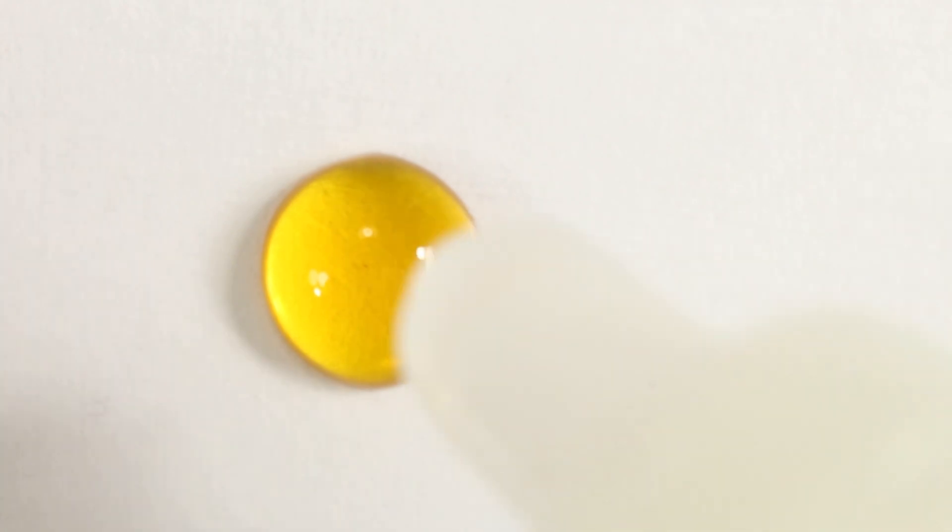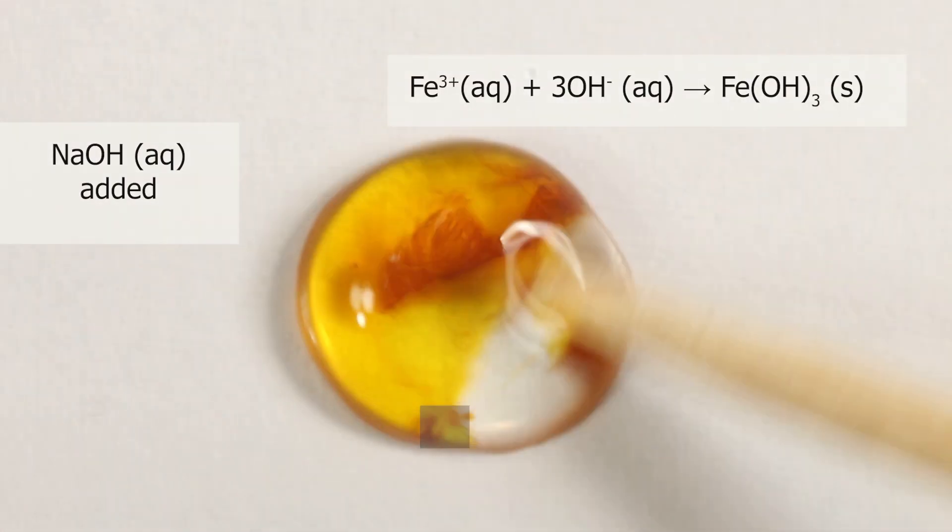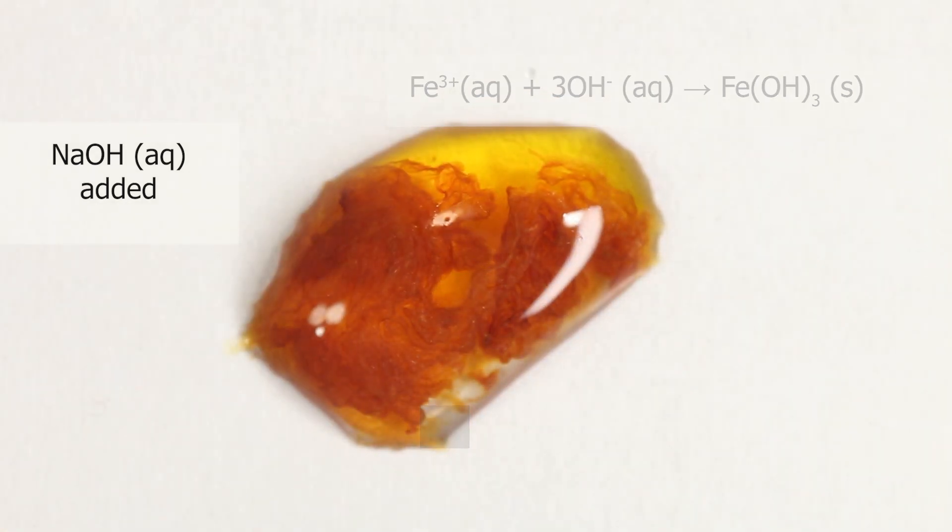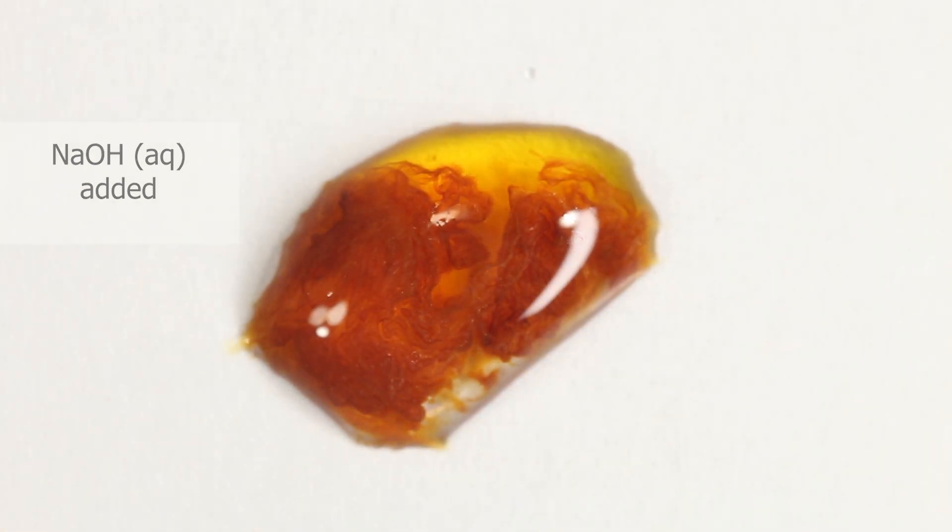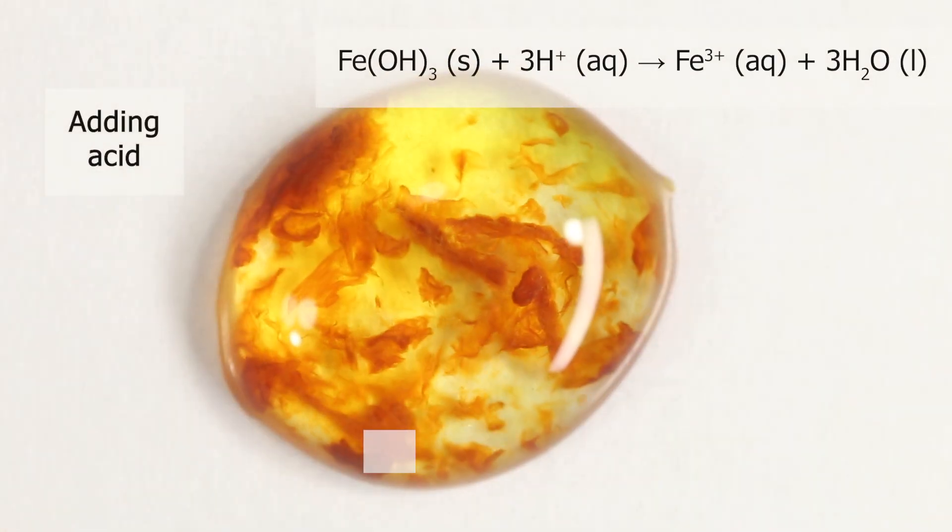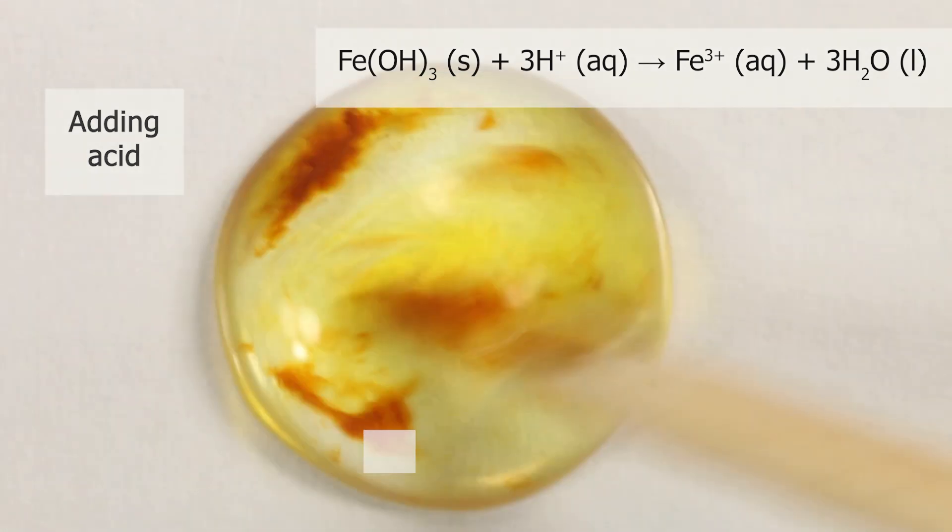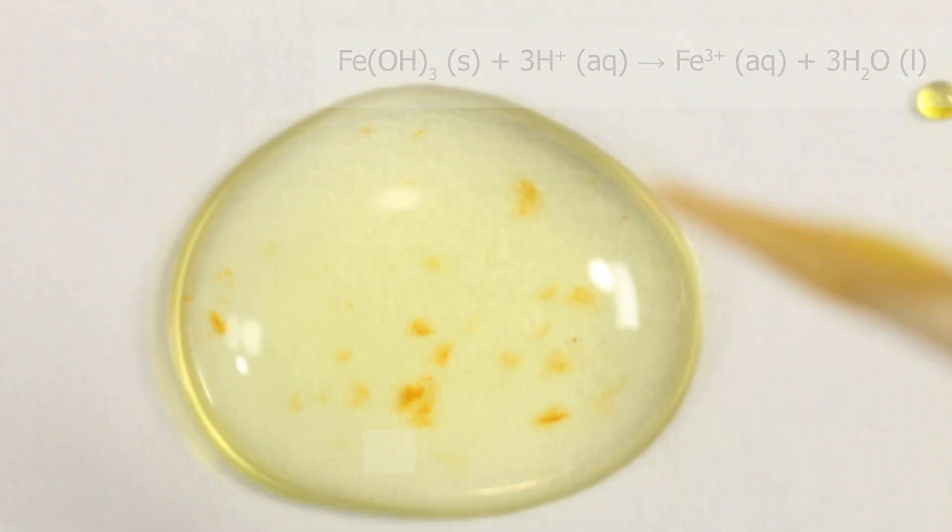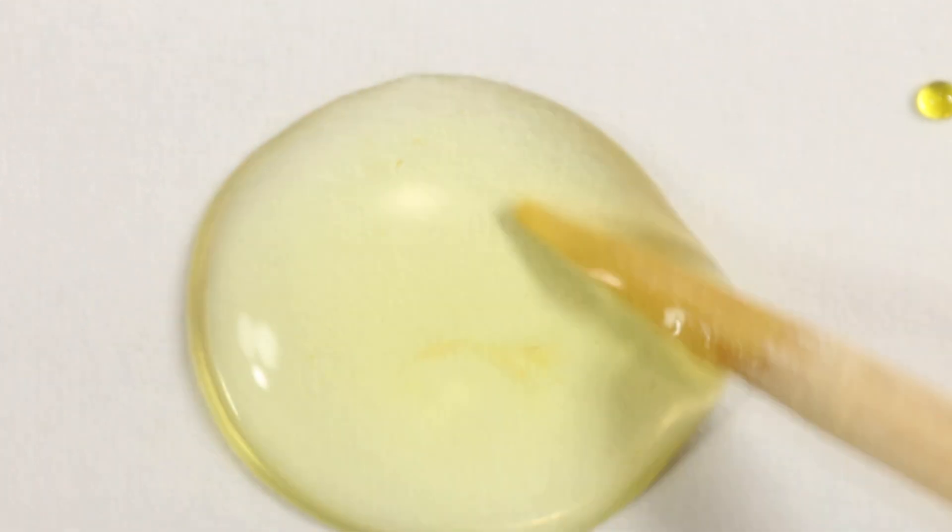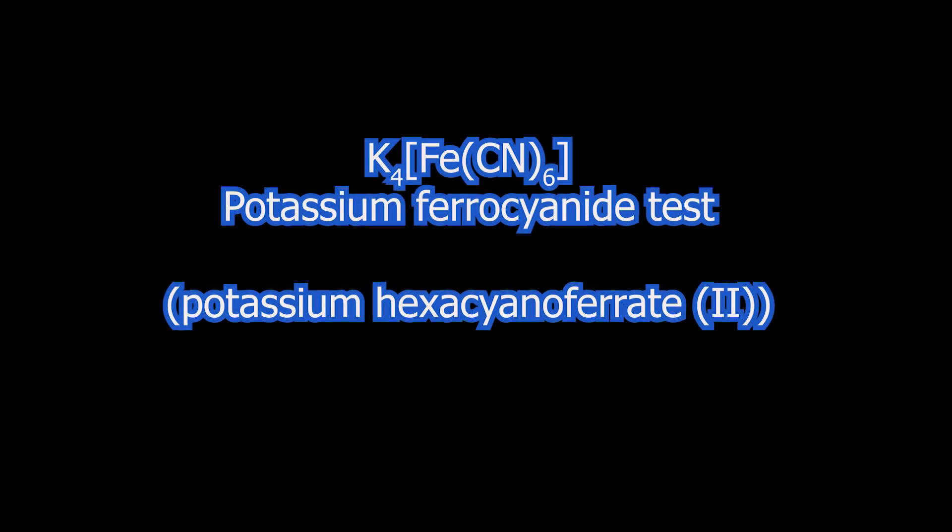The same thing on micro scale. Iron-3 chloride and sodium hydroxide. Brown gelatinous precipitate which redissolves on addition of an acid. Typical iron-3 hydroxide. Now let's look at another test.